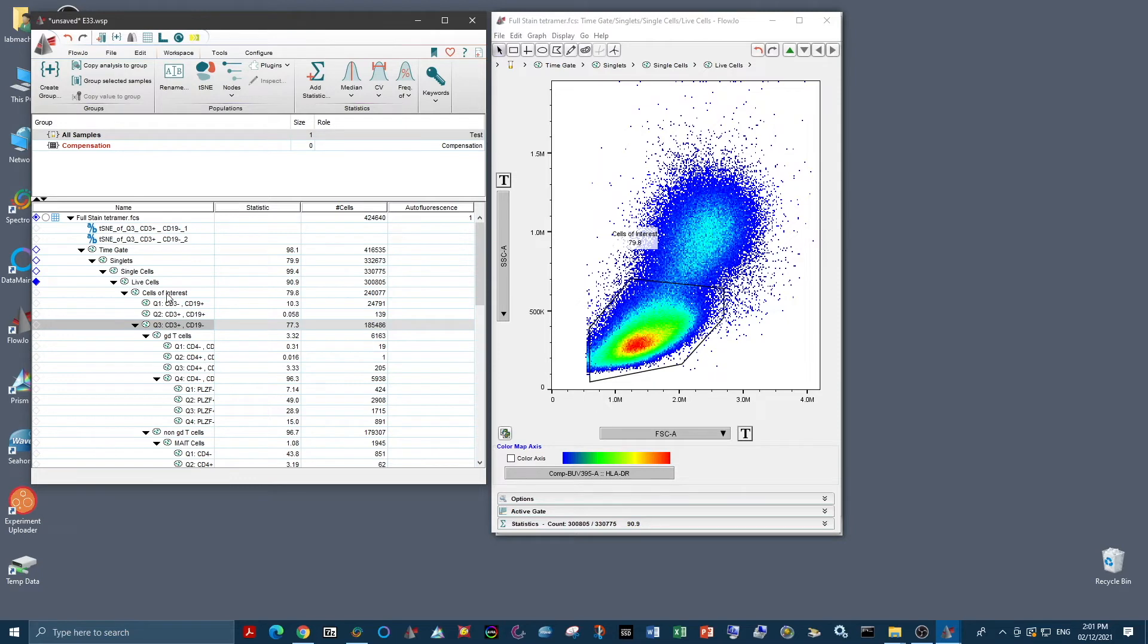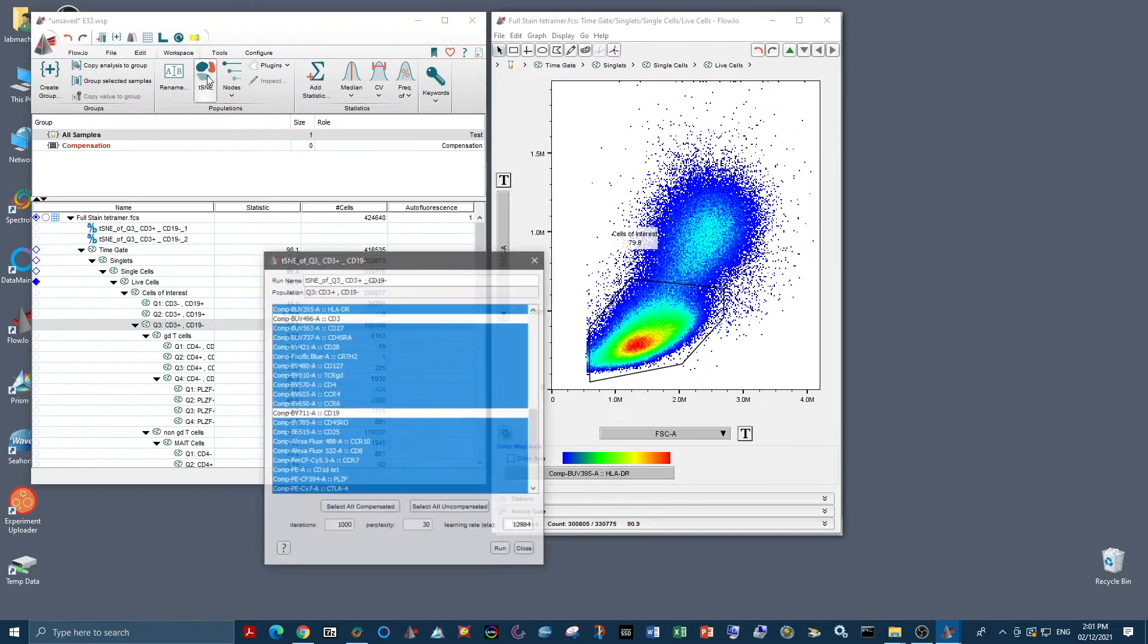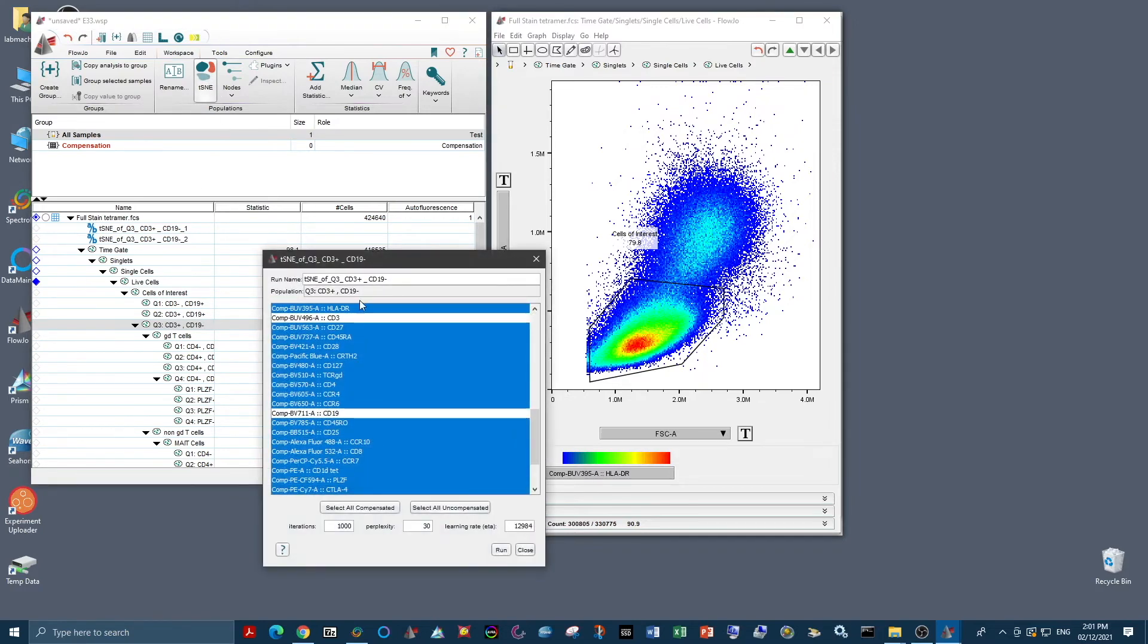So we took our time gate, our singlets, our live cells, our cells of interest. And I've mentioned that this is a panel for T cells. So we're also going to go from the level of our CD3 positive T cells. So we want to run the tSNE on this population and I've selected the correct one here.